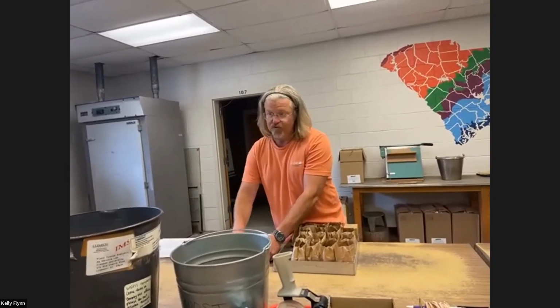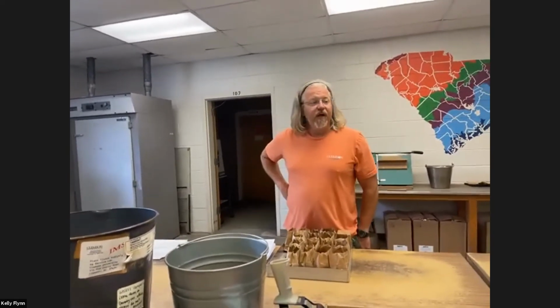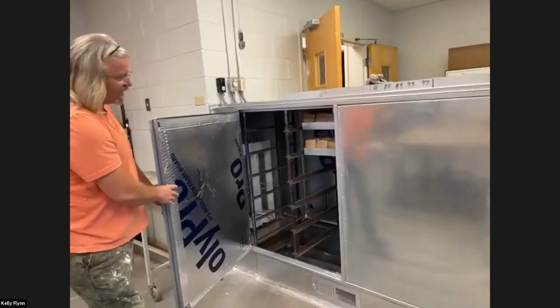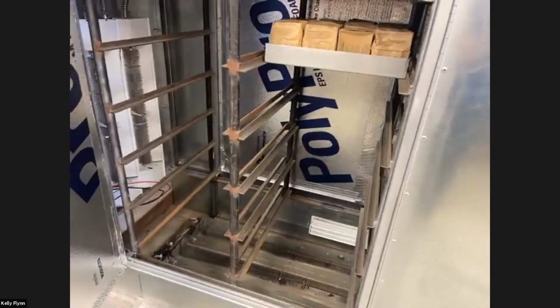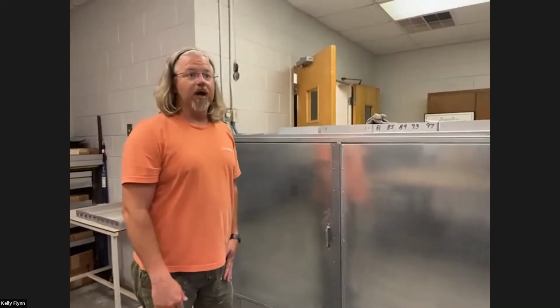We have new soil grinders. They've been refurbished. We also have new drying ovens that are behind us. Yes, we can point out the drying oven. This is a big step up for us. I know it kind of looks like a big battleship, but before this was all plywood and it was not insulated. So you can actually see the soil in there drying. There's heaters at the bottom, and then there's a fan that pushes air across. We usually like to let these, if we can, dry overnight. And then next morning we'll pull them out and start our grinding procedure.